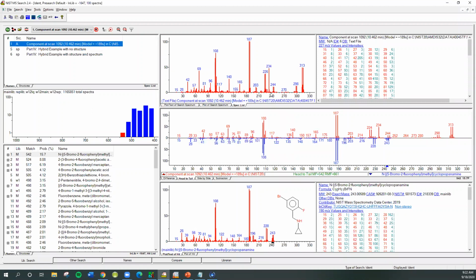So we have our spectrum for consideration up here. You can see it has some information, but what's lacking mainly is it searched the library and said, oh, it's not there. The best match, if you see down below, is 500 out of 1,000, which means there's nothing really there. It's a lot of indication that it's consistent, but it's not in the database. So now we're ready to add it, but we need to get a structure associated with the spectrum.